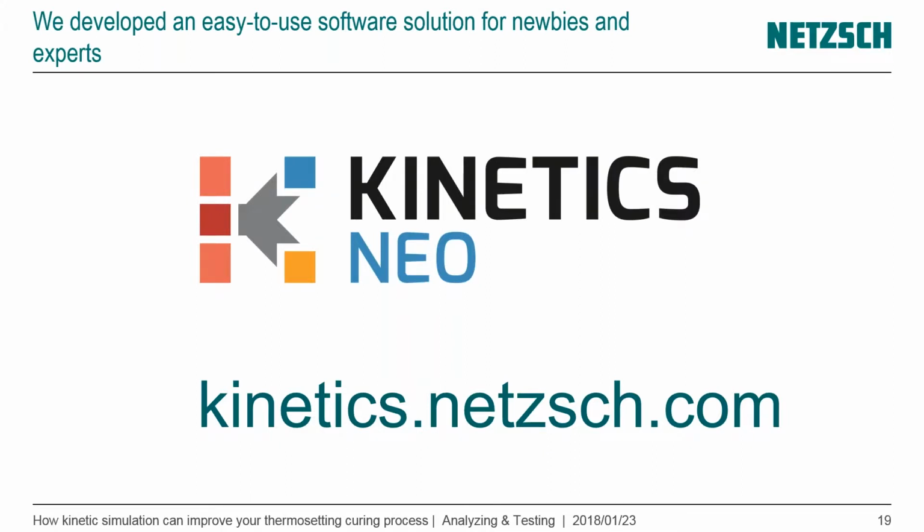Maybe you can tell me if you were working on components or curing parts in the past where you had big trouble. Maybe you are able to tell me the story so we can talk about that with all the participants at the moment. Because I think it would be very interesting to have user stories of what we did in the past, what went wrong, what we improved. Can we do that, for example, with kinetic simulation?